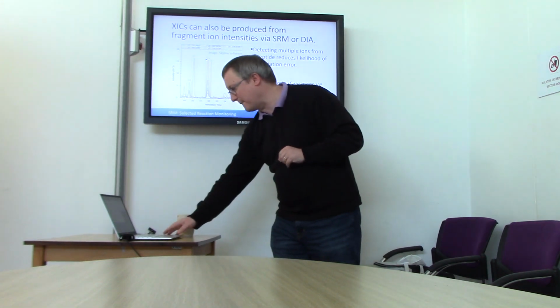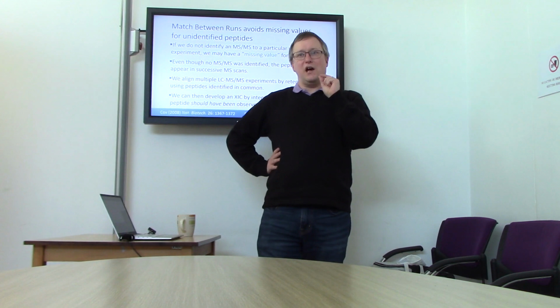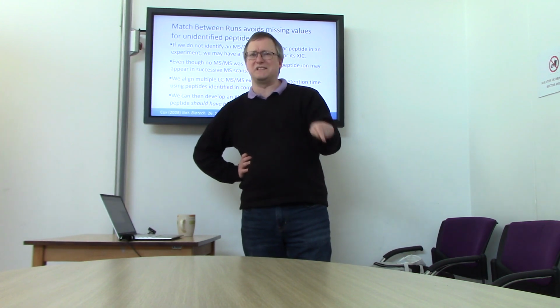Okay, now, what happens if I integrate the area for a peptide that was identified in 4 of my 5 experiments, but in the 5th experiment it was not identified.